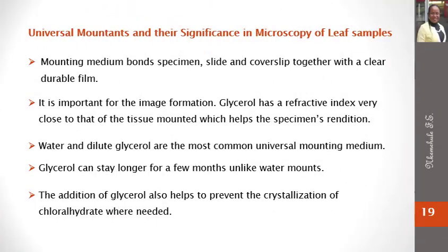Adding mountants to the prepared specimen before viewing under the microscope is not for the fun of it. The mounting medium binds the specimen, slide, and cover slip together with a clear, durable film. Of course, you have to make sure that your slide is not cloudy before viewing under the microscope. It also helps for the image formation.